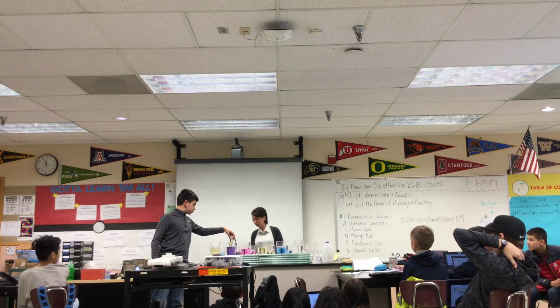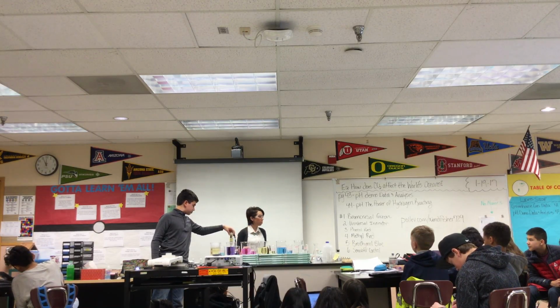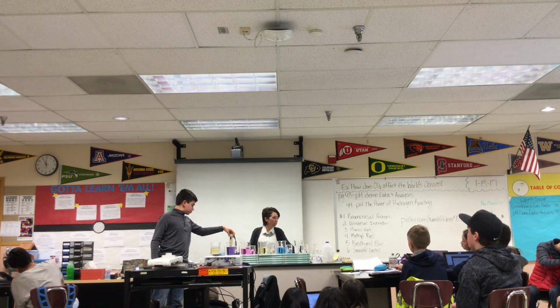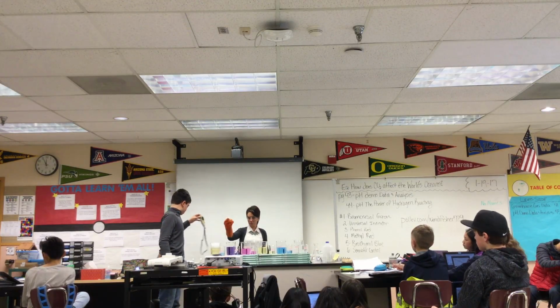What do we got? 10.6. 10.6, and just so you know, you don't have to put it in about 2 centimeters next time. There you go. 10.60 for our initial pH. Does that fall in the purple range according to the chart? Mm-hmm. Yep. Okay. You're good. Here we go.